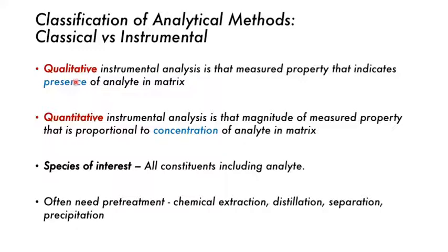Some spectrometers have prediction software, but by and large, that's incredibly inaccurate. So usually we need to use our chemical knowledge and our intuition to actually assign the peaks. And this can be important.